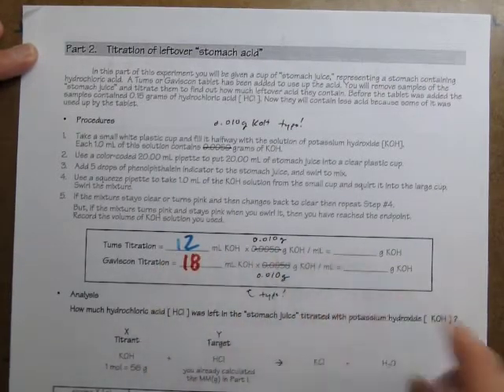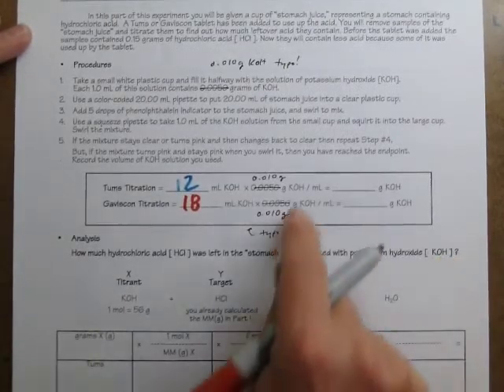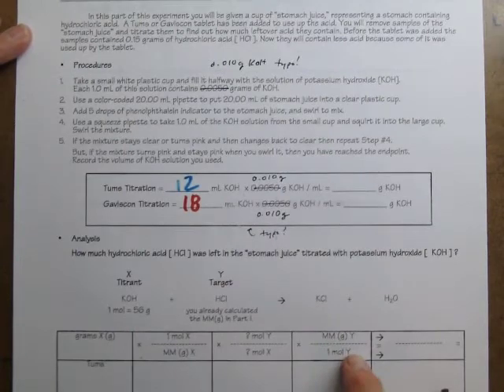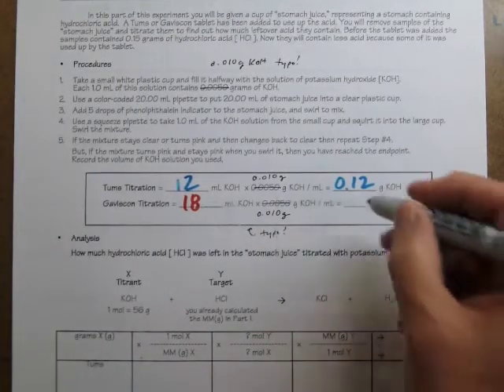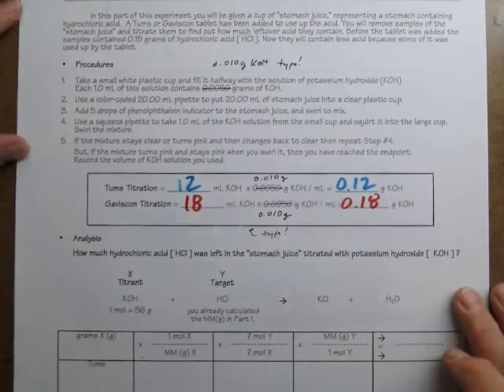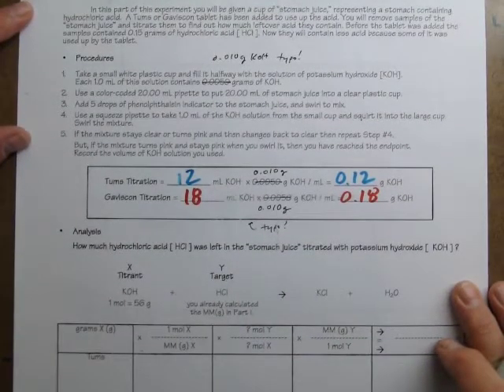How many grams of potassium hydroxide were in those milliliters that I added? I don't know which version you're looking at, but there was a typo that I corrected right here. We'll multiply to find out how many grams there was of potassium hydroxide in both of those titrations. And then we'll use that to figure out how much acid remained in each of the samples.